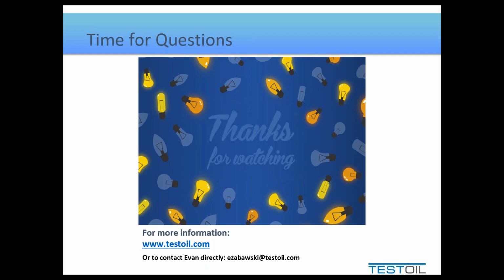Hi, Evan. Thank you so much for that. That was great. It looks like we do have a couple questions. Our first one here is from Edward, and he says, ferrographic techniques have a limitation for organic iron contamination. Can you comment on any ICP methods for organic iron analyses?